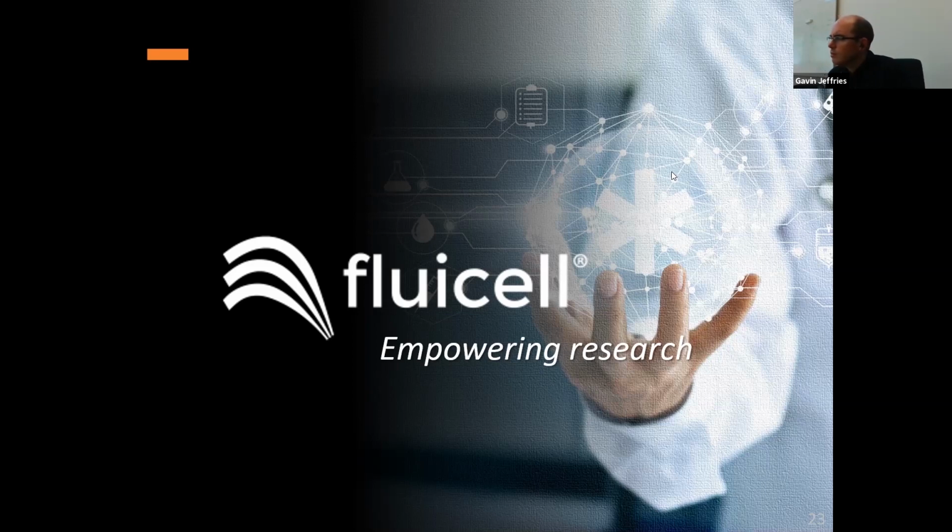Thank you. So Evo has a cell biology background and says that although the concept sounds great, has a question about layering each cell with a skin model. For example, would it be great to make an immature model of undifferentiated cells and let it mature? Printing the external environment to enhance self-assembly of the cell would be best. Would this be possible with your system, or is it only for printing the cells?